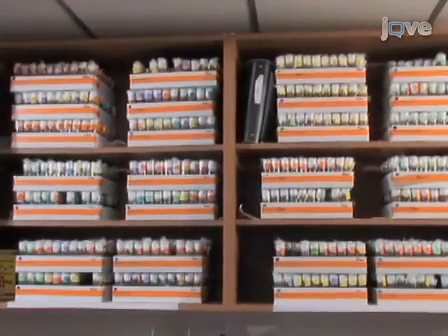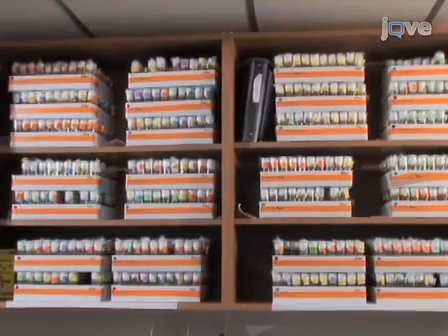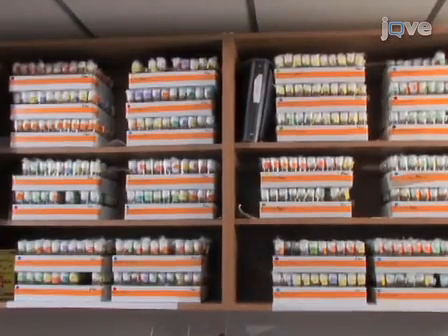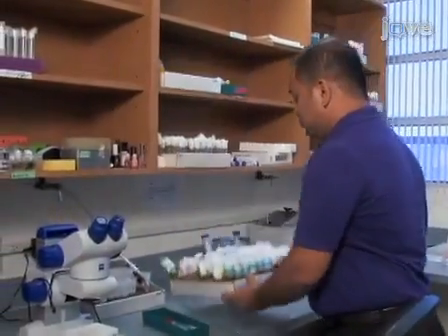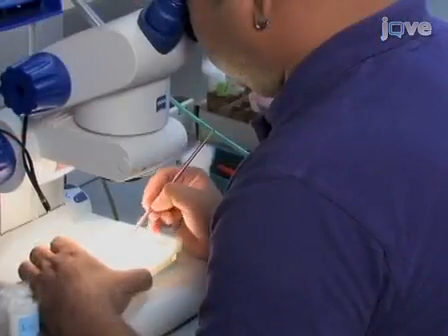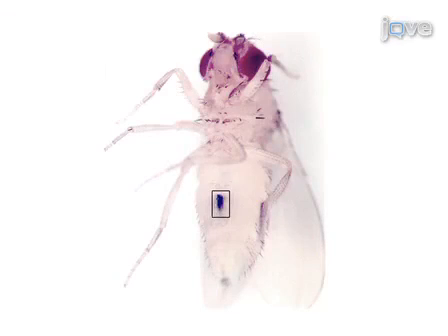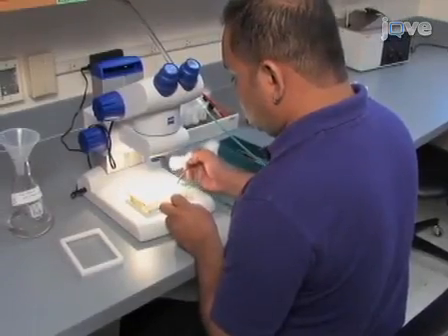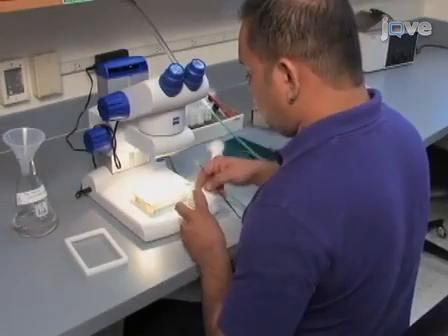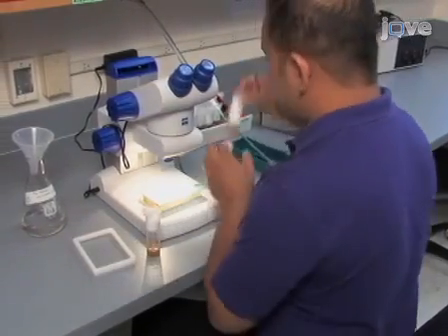Maintain the flies on a standard cornmeal agar molasses-yeast medium at 25 degrees Celsius on a 12-hour light-dark cycle. On the day of eclosion, sort virgin flies into groups of 20. Virgin flies are identified by their light color and a dark greenish spot located on the underside of their abdomen. The flies should be transferred into a fresh vial every three days, and sibling flies should be used to minimize differences arising from genetic backgrounds.